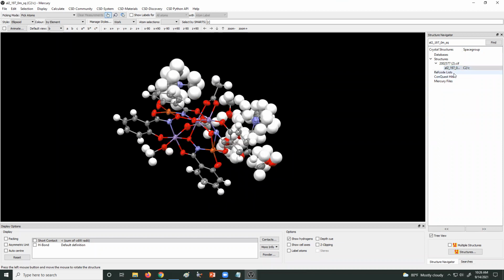Occasionally, you'll see 3 or 4 listed here. Like sometimes there'll be like 10 compounds in one structure. And you don't need to do all 10. You just need to do one, pick the one that's interesting to you, and you click on it and it will show you. So if you had more than one, you'd see it listed here. There's only one structure here.